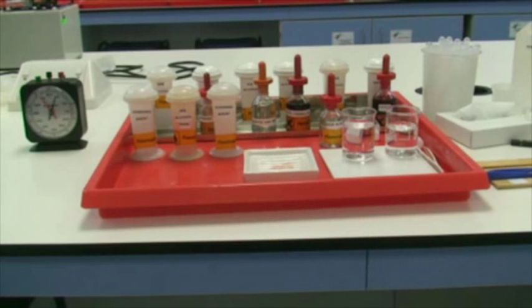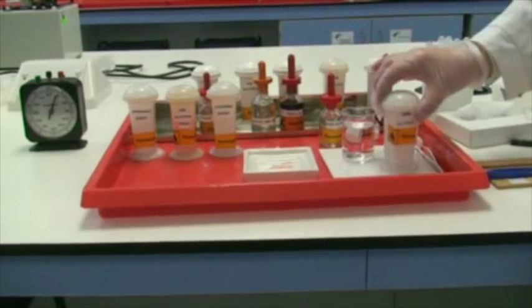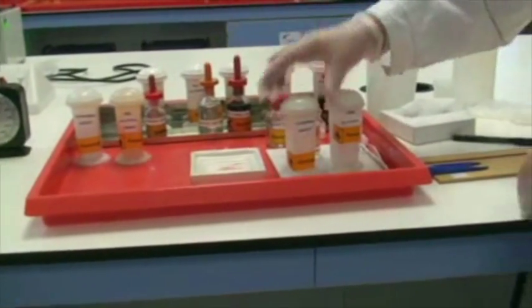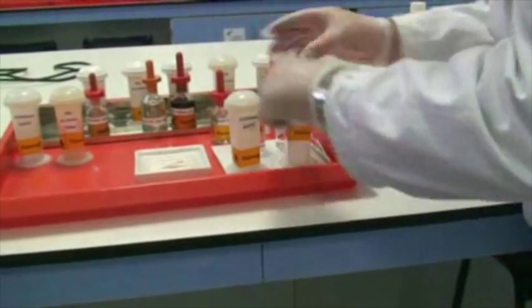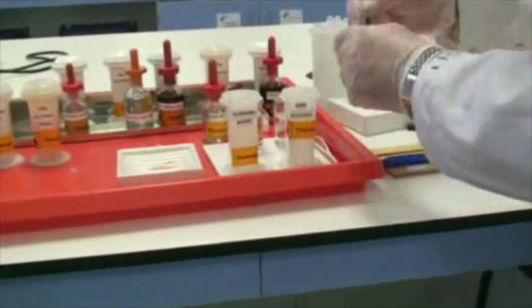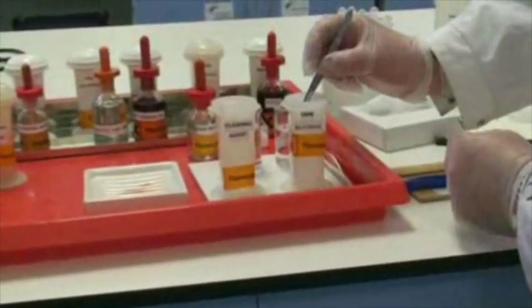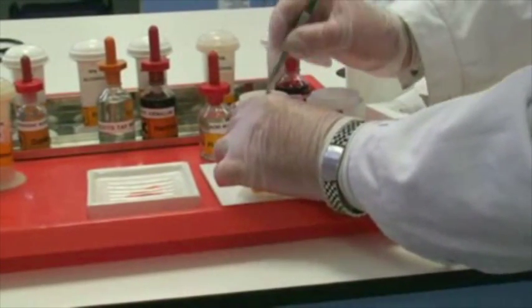We're now at the point where we're going to transfer from the last absolute alcohol into the clearing agent. The slide is going to spend at least 10 minutes in this final step before we mount the section.